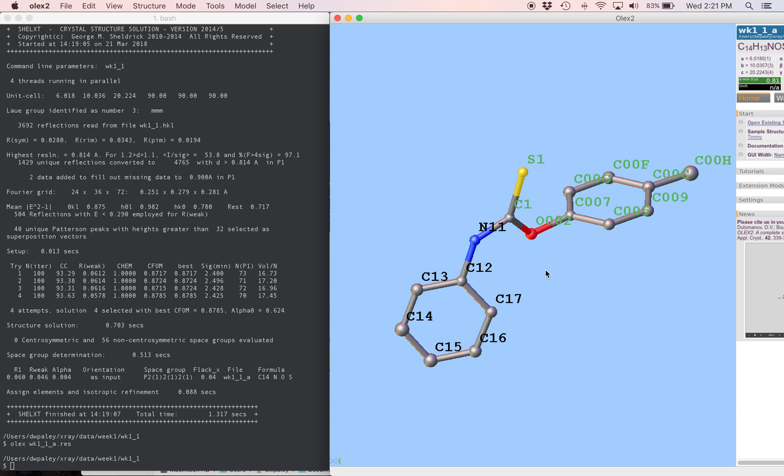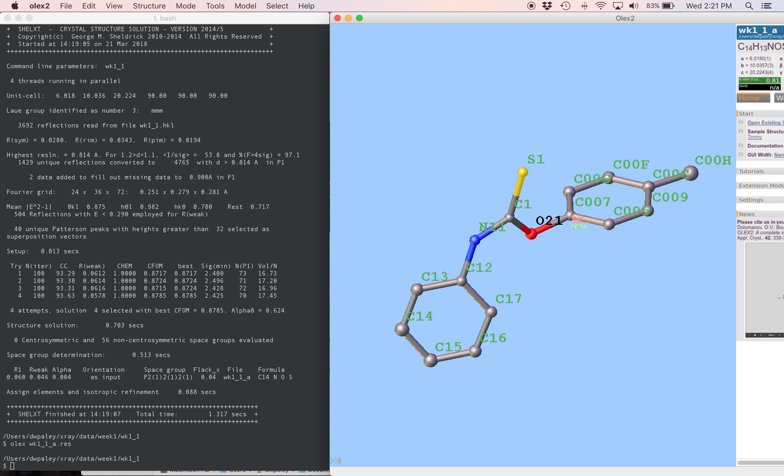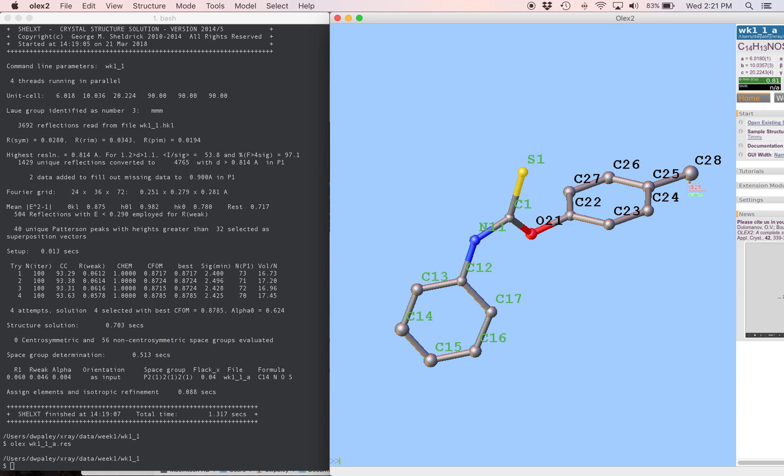I'm going to go over to the other side, and do mode name again. This time we're going to start with 21. This is O21. I'm going to go around the ring. It's nice to keep rings all together. And then after that I'm going to come over here and get the methyl group last. I'm going to hit escape. And now the structure is named.